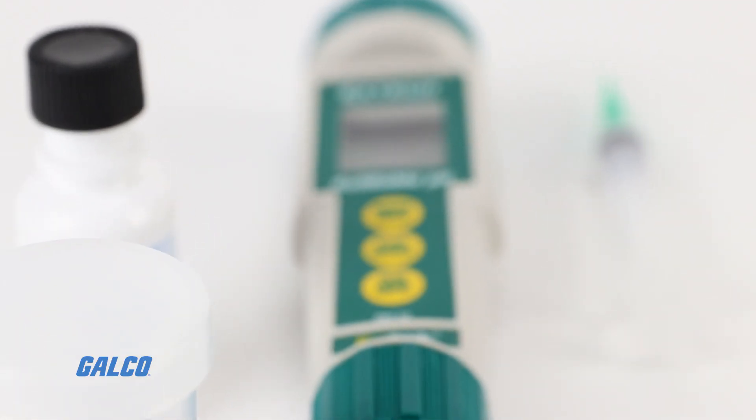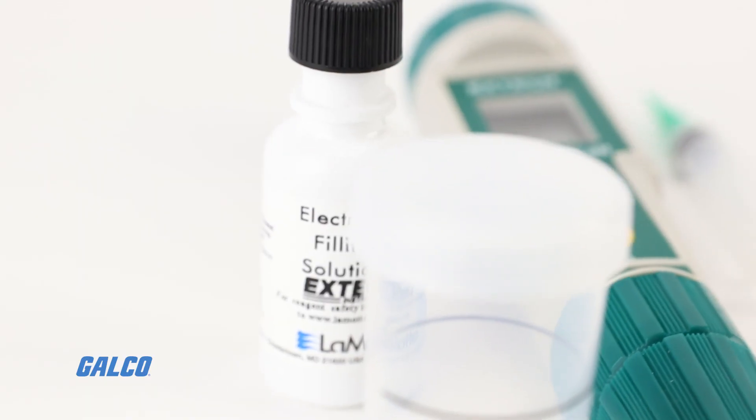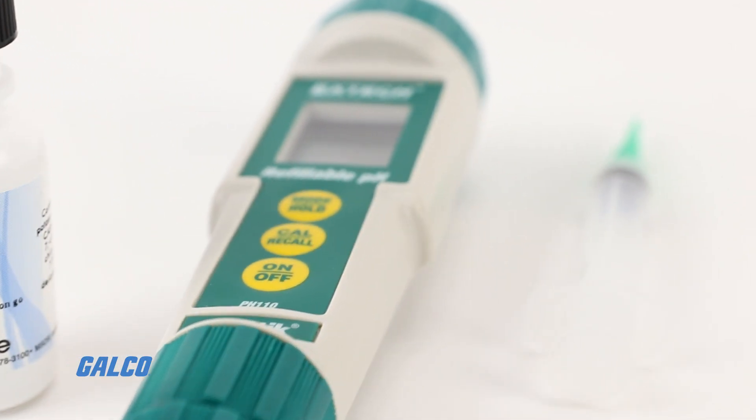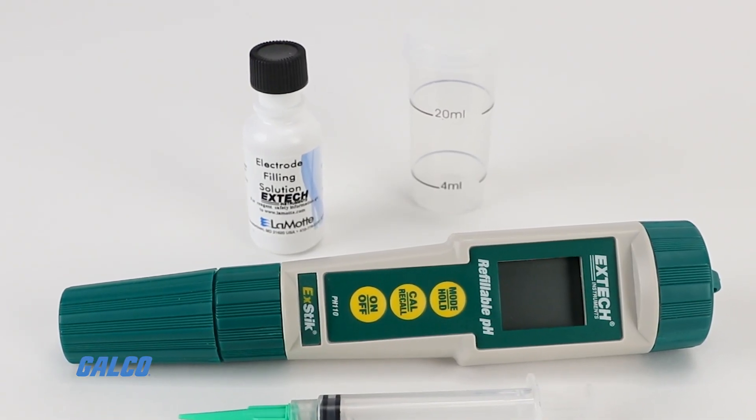X-TEC's PH110 X-STIC refillable pH meter is a waterproof pH meter used to measure pH levels in liquids, semi-solids, and solids with a durable refillable electrode.